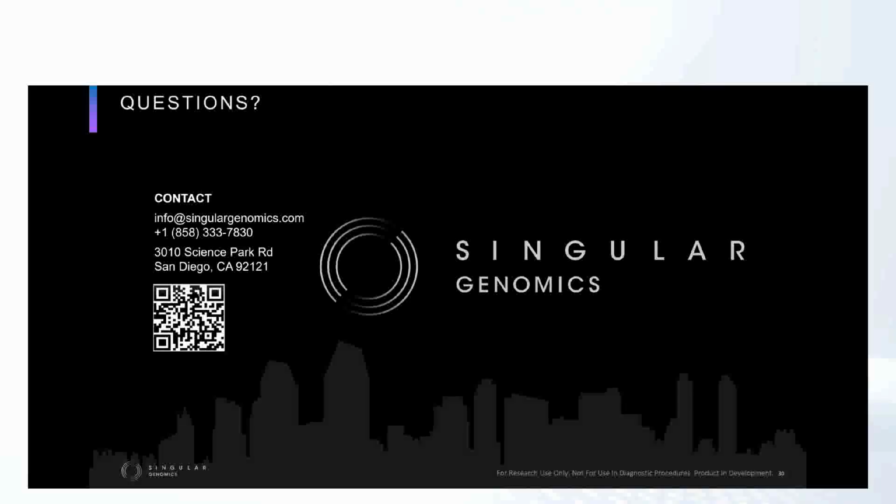So 0.5 micron resolution, a little bit below 300 nanometer pixel size, but like I mentioned with the transcript detection, we're not necessarily bound by those constraints because we are doing multiple rounds of that. So two transcripts can be right on top of each other. So you're not actually bounded by physics in that scenario, right?